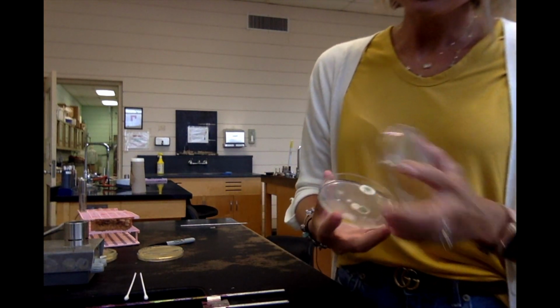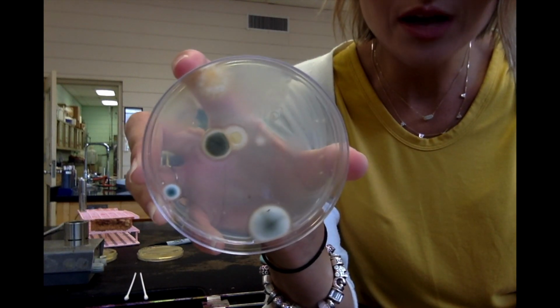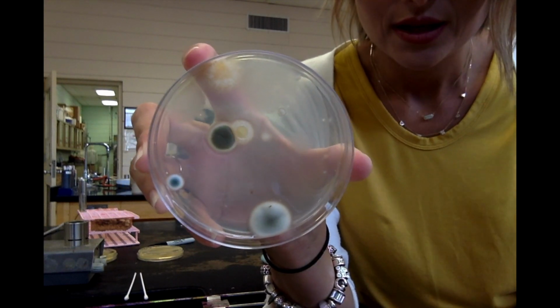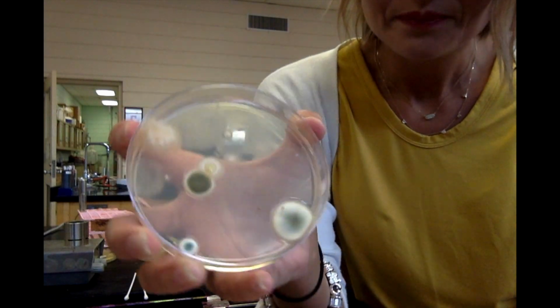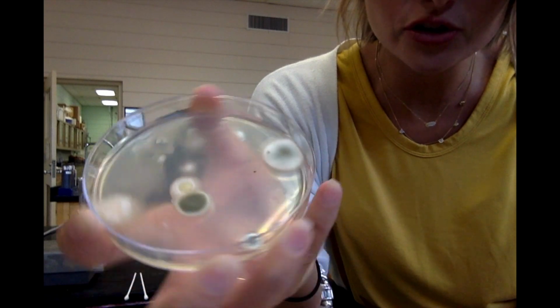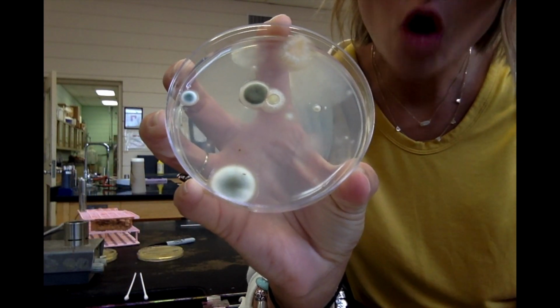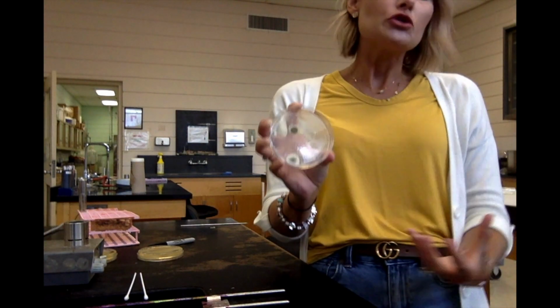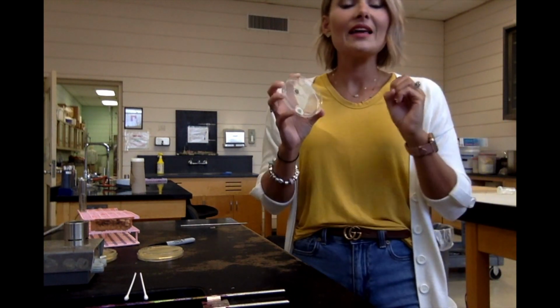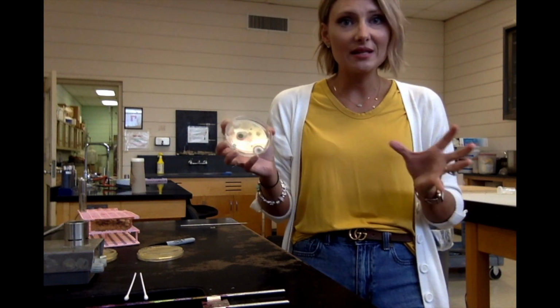So, you'll see that the fungus looks completely different compared to the bacterial colonies. They look hairy, okay, or fuzzy. That's the word that I usually get in the lab if we were actually looking at these in the lab, okay? That's called filamentous growth. So fungi colonies give off these hair-like projections, and those are filamentous.